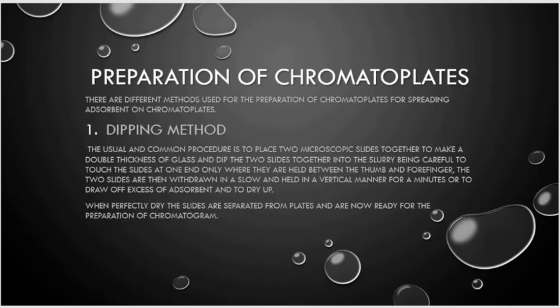Now the first step for TLC is the preparation of chromatoplates. There are different methods used for the preparation of chromatoplates, for spreading the adsorbent on the chromatoplate. The first one is the dipping method.